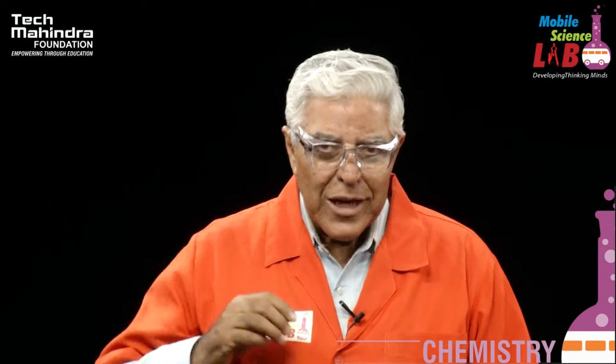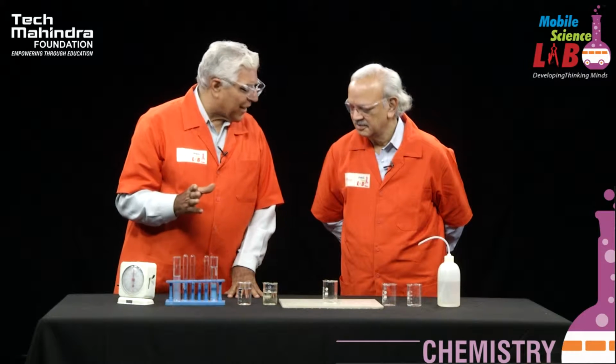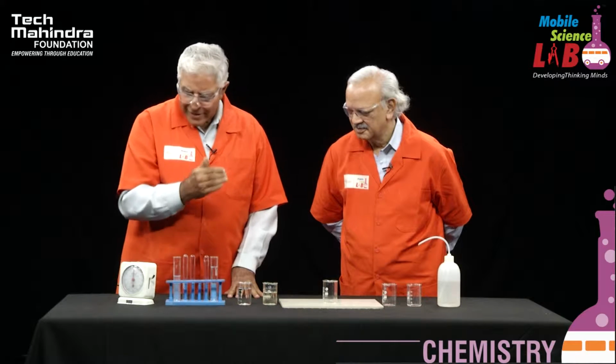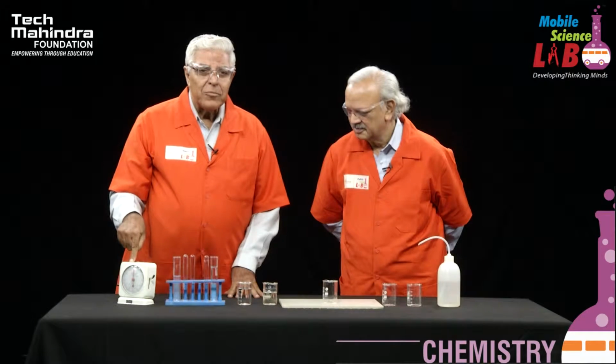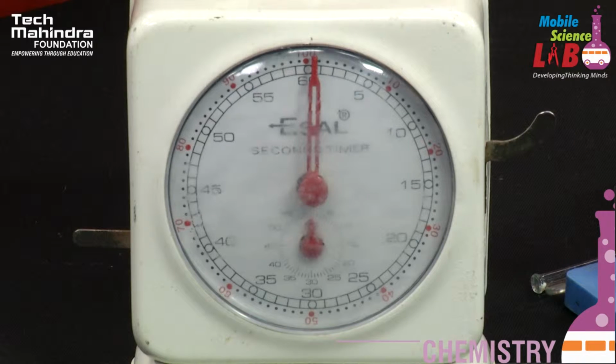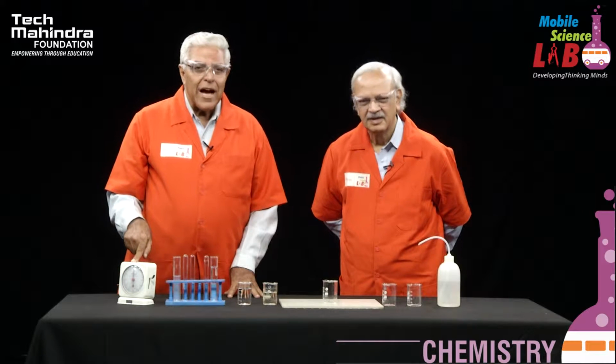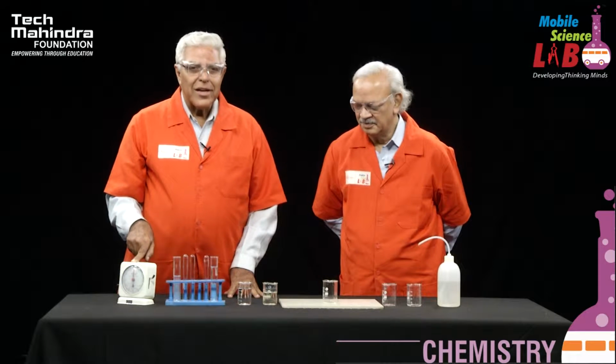But to make this simple reaction into a clock reaction, we want to slow down the reaction a little bit so that we can time it with the help of this particular stop clock. That is why this reaction is called an iodine clock reaction.